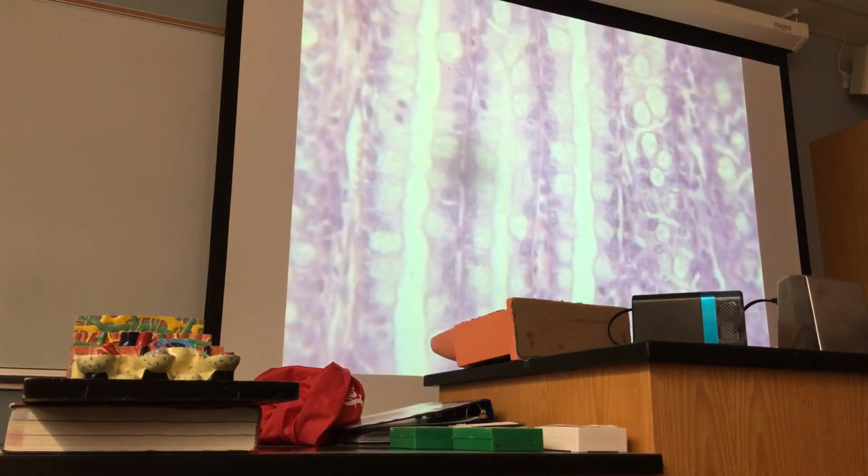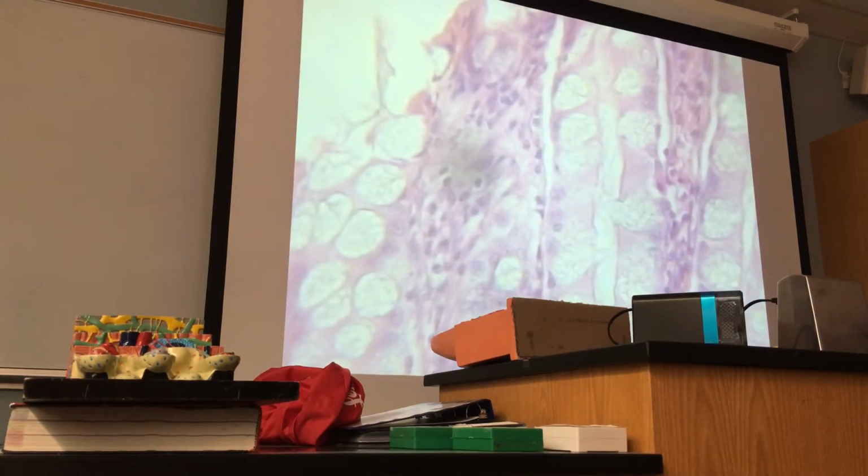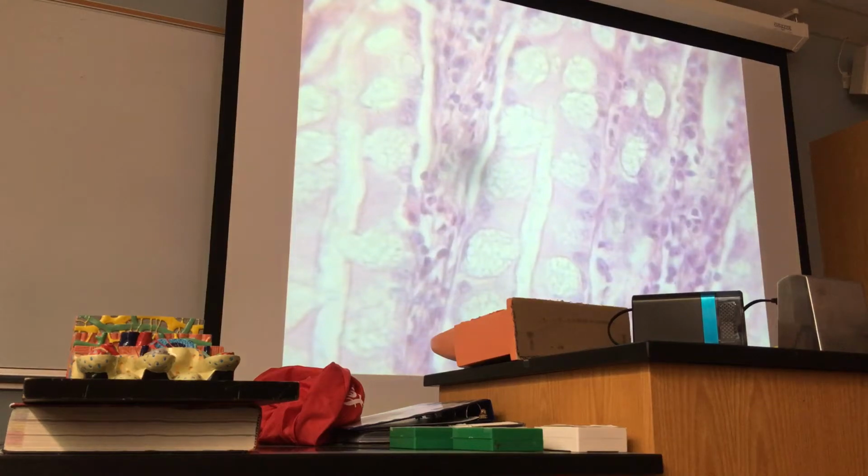Any question? You see much better now here? Look here, goblet cell. Another goblet cell, but in between, what is that? Absorptive cell. This is one. There are two absorptive cells here. And how many goblet cells? Many, too many. Thousands.